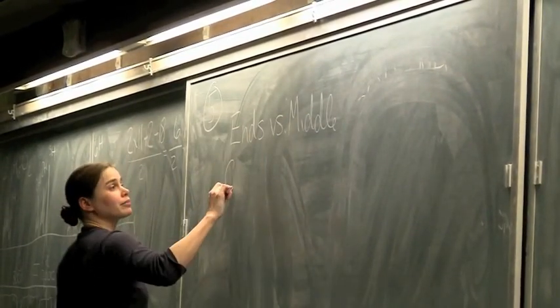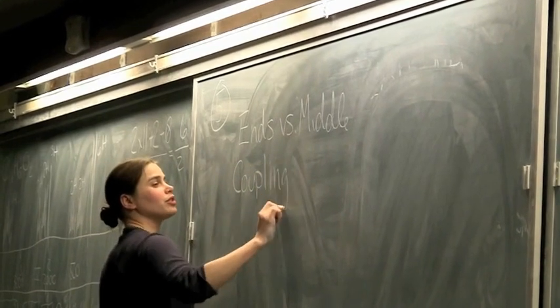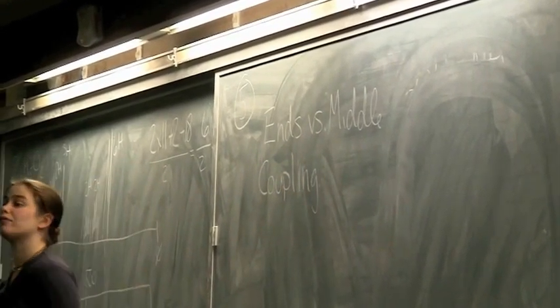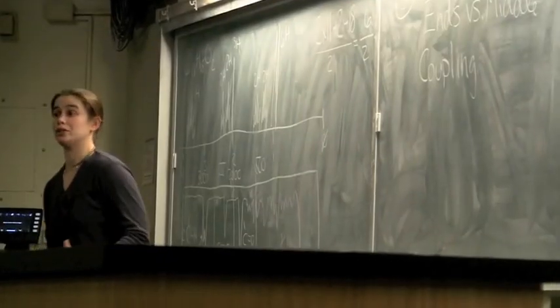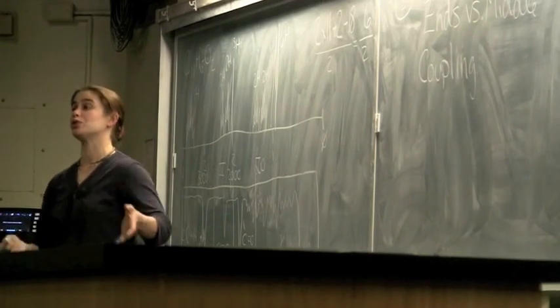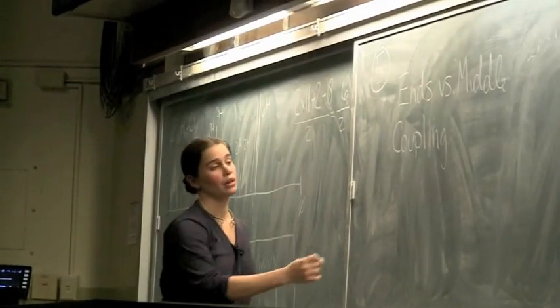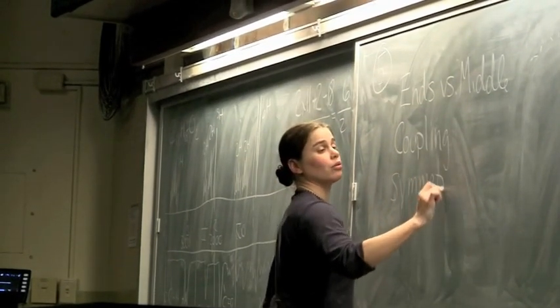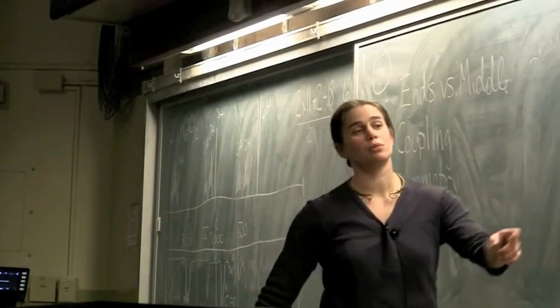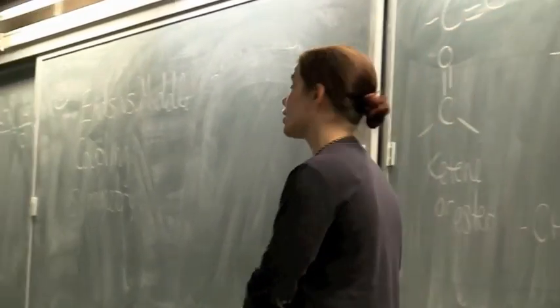Think about coupling. Is there a single CH in the molecule? If there's just one CH, who's next to it? It's gonna have a funny coupling. Is there stuff that has CH3 next to it? You have lots of CH2s where you're seeing 2, 4, 2, 4, 2, 4. They're all gonna go together. Look for symmetry. We have a little bit of symmetry in this molecule. We know those two CH3s are exactly the same.